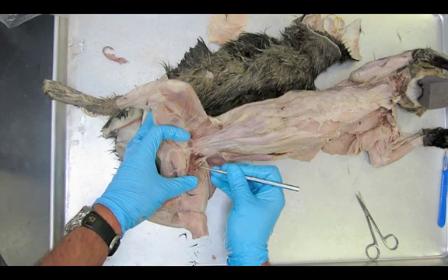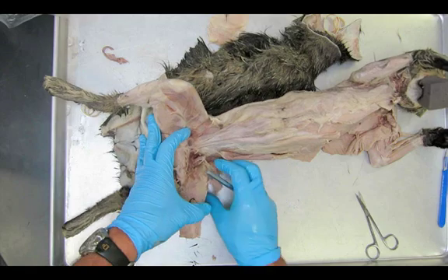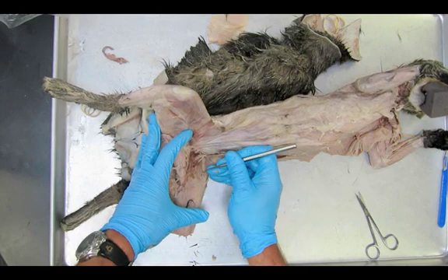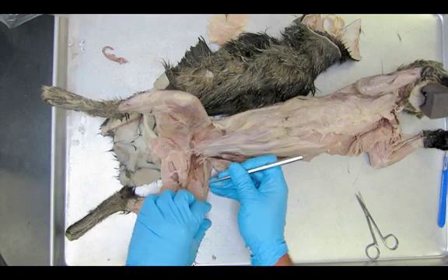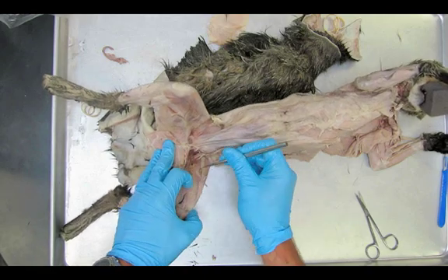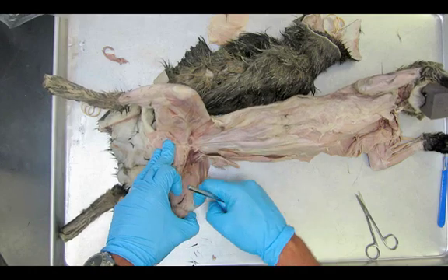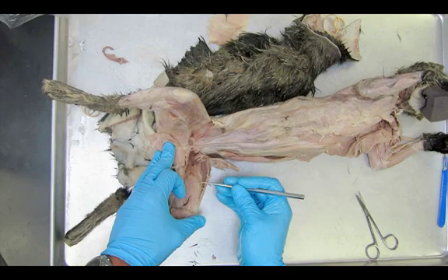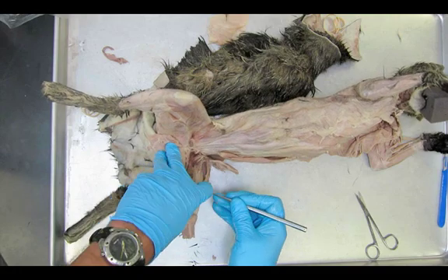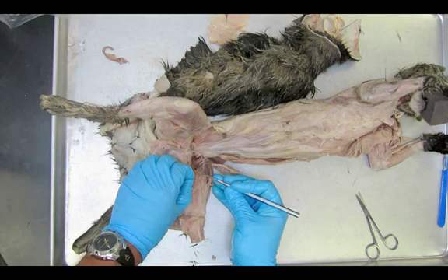So I have my iliopsoas muscle, pectineus, adductor longus, adductor femoris, and semi-membranosus. Now we're going to move on to the quadricep muscles. There should be four muscles — we know them as our quads, but there are actually three we can see here. I'm going to lift up and clear away the fat, getting underneath what we call the vastus medialis.